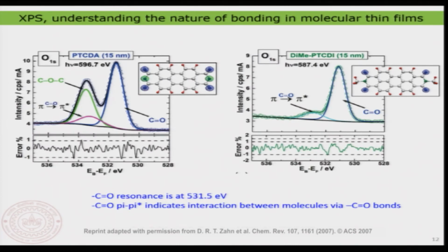So, the bigger examples are this, that we want to look at big molecules adsorbed on the surface, and in this case the same example as we have actually looked at in the UPS. This is that PTCDA molecule, which I have already told you is used in the organic semiconducting molecule industry. And here what you are looking at is the XPS data of the same molecule. And it is also basically done from the same film.